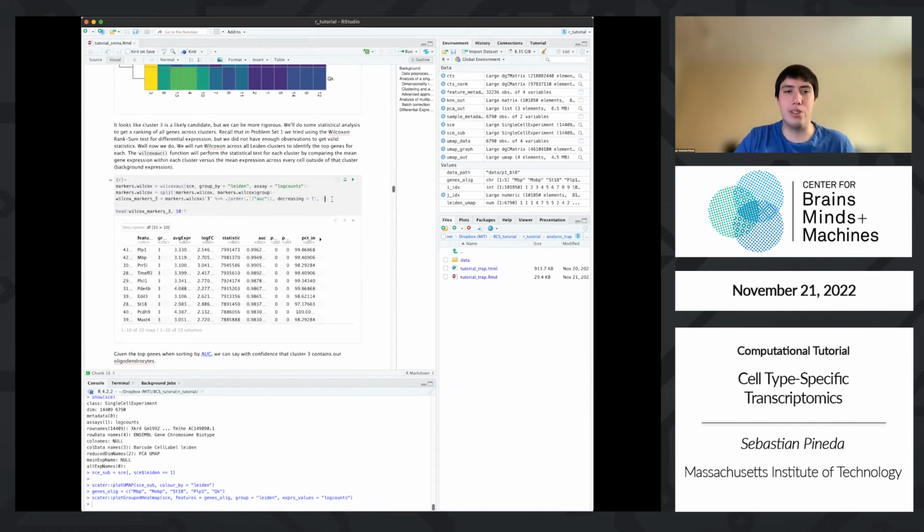And then I can also do something very neat, which is de novo marker gene detection. Sometimes we know what the markers are, sometimes we don't and we would like to know, or sometimes we know a few markers but we'd like to find more of them. Again, in that GitHub repository, there's a tutorial on how to do this manually. This is just running a Wilcoxon rank sum test, which is asking, okay, I'm telling you that I have 14 groupings of cells.